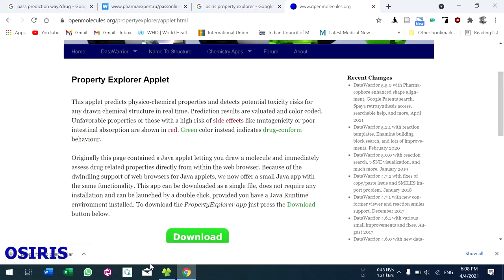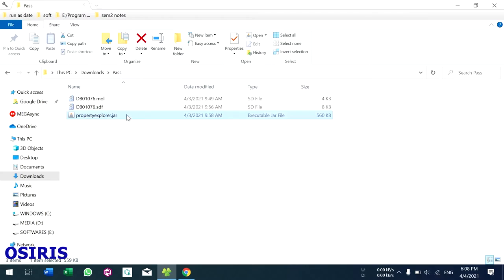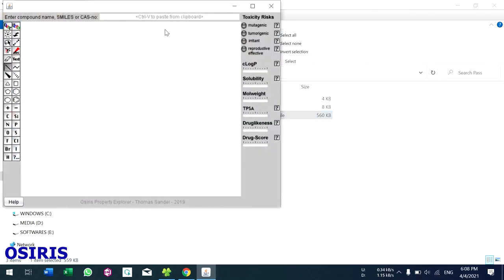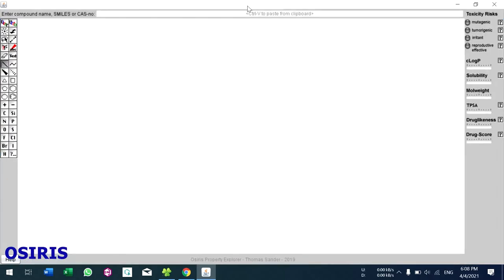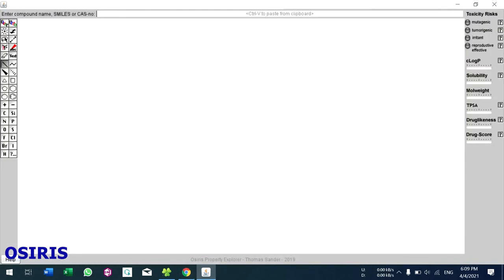To use this applet, you have to download the Osiris Property Explorer. After downloading, double-click the file to open it. This is the Osiris Property Explorer window. You have to enter the compound in SMILES format, or you can sketch it using the tools provided. Results appear in the right-hand side window showing toxicity risk and other properties.